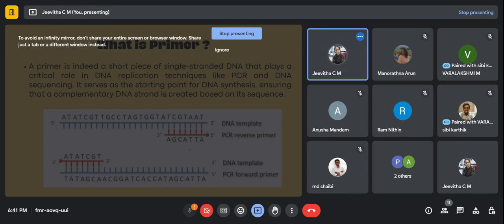So, what is a primer? When you have to amplify a particular part of a gene, or get your gene of interest from the genome, or you are focusing only on a certain region to study mutations or knock-in knockout possibilities, you need not amplify the entire genome. You have to amplify only a certain region that is unique to the gene. In those cases, primers come into play.